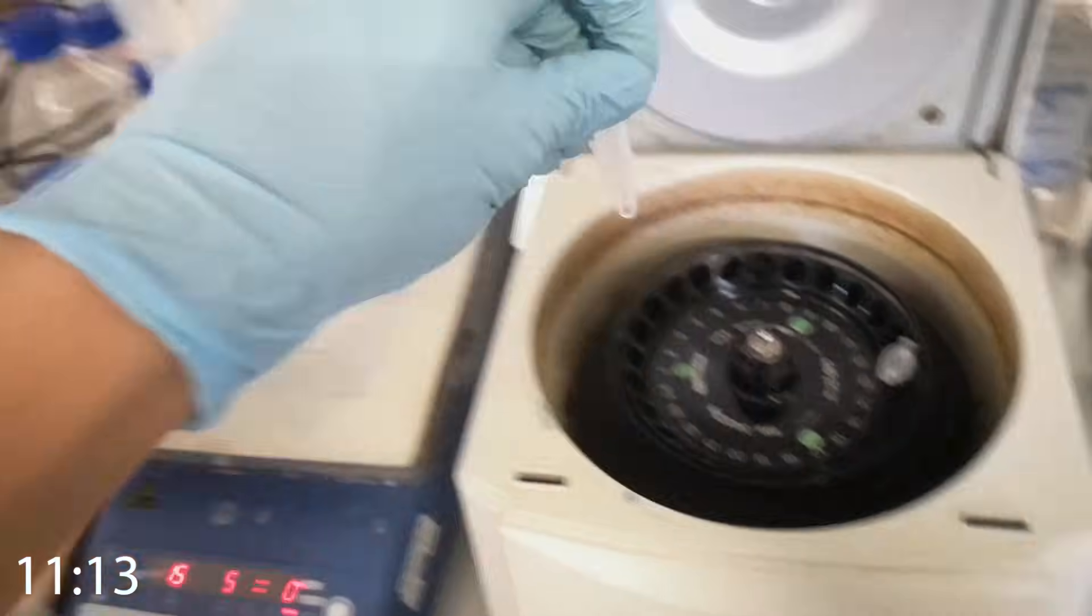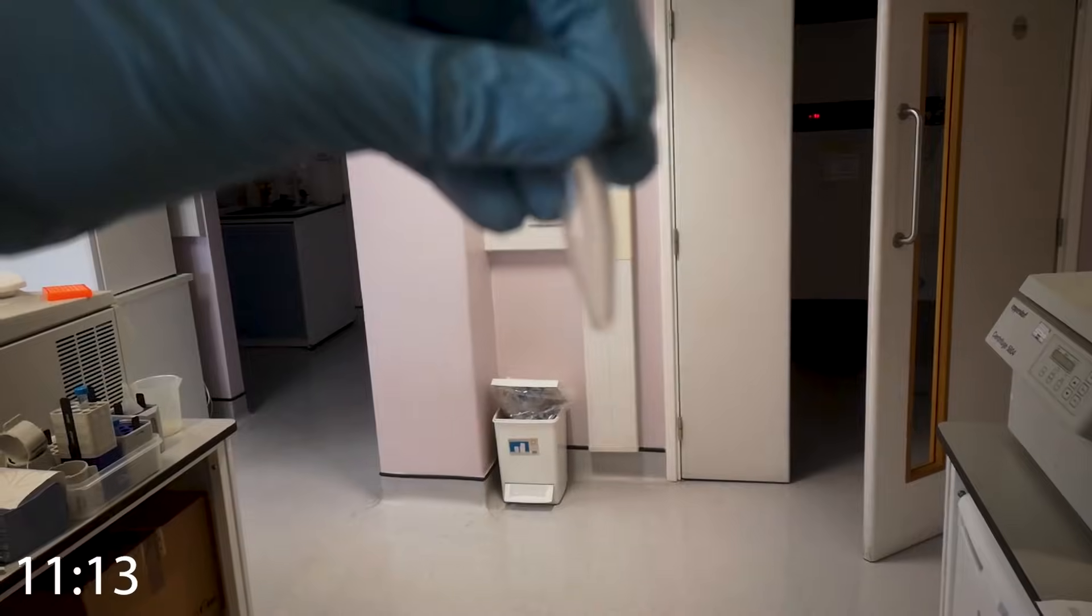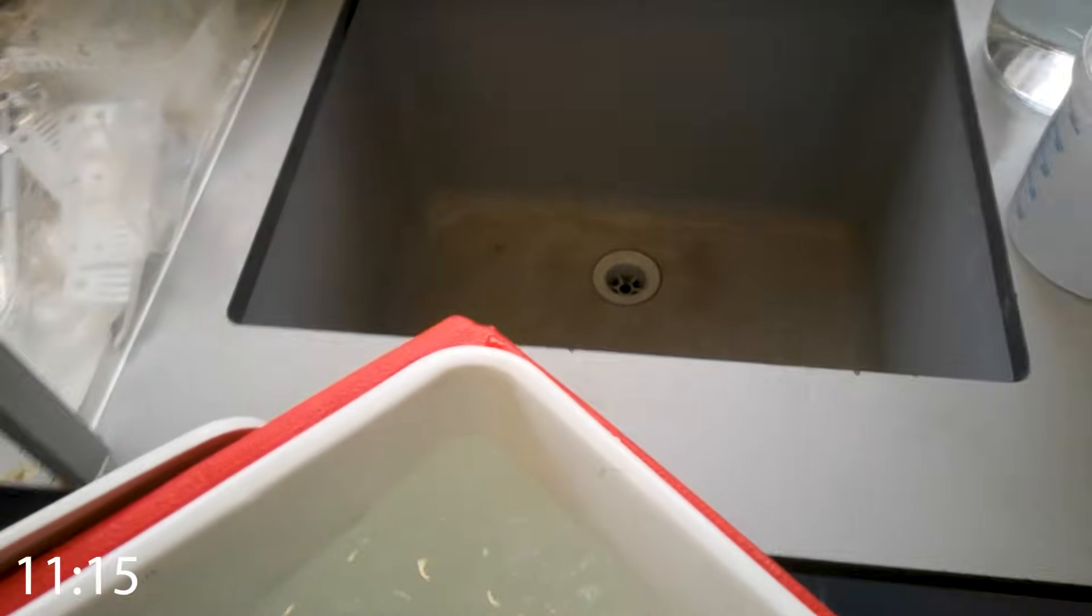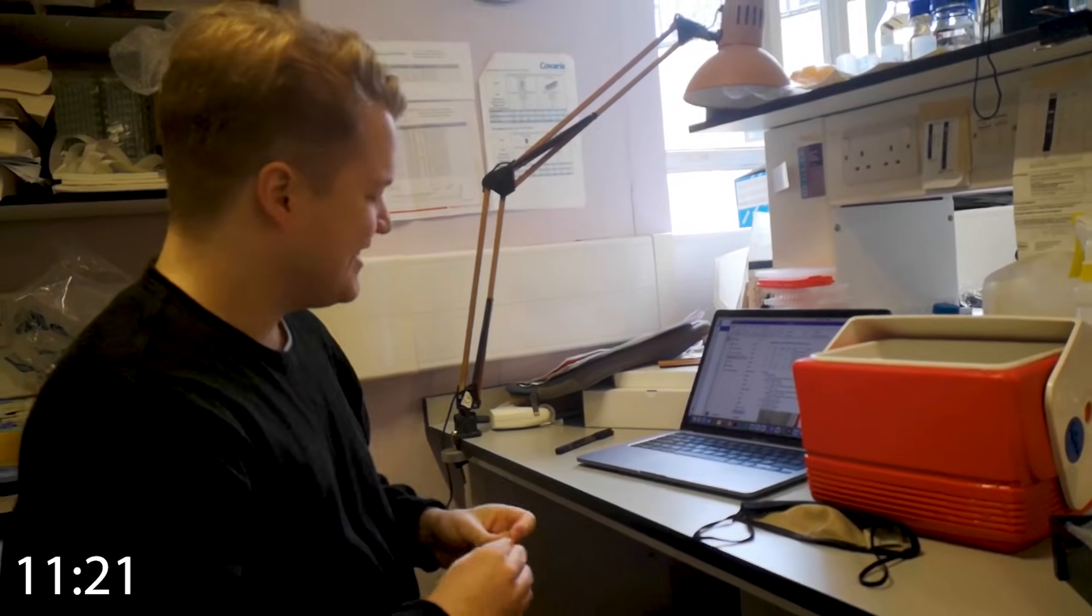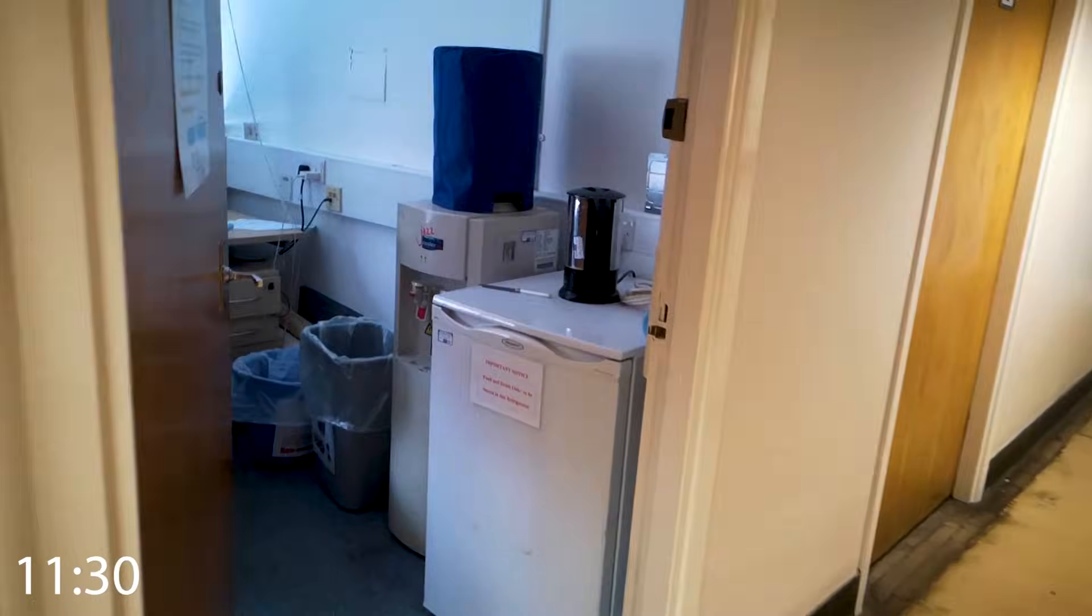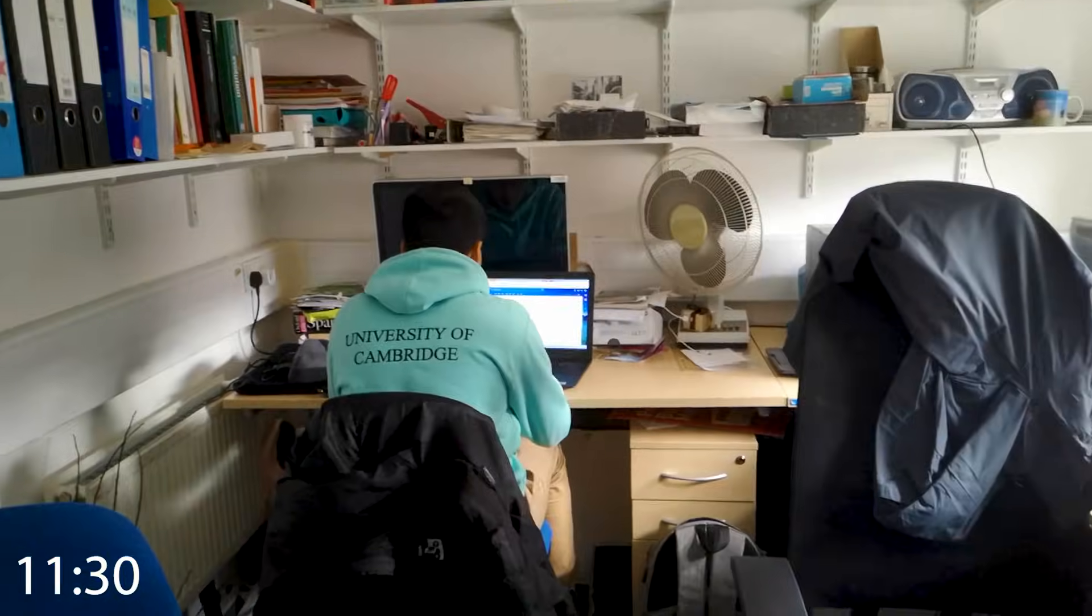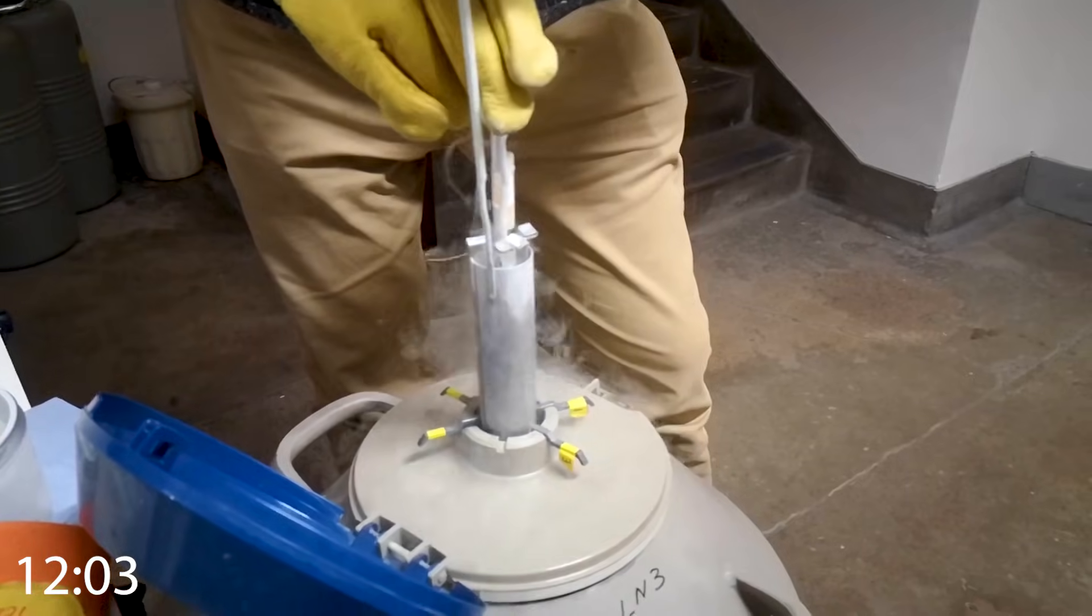Now when you open it, there's now loads more at the bottom. I then dump the ice into the sink to stop global warming or something. This is my lab partner Peter, he's currently like an hour behind, slacking as usual. And I head to the office where I see the undergraduate student who will definitely be my boss one day. And then our supervisor teaches how to freeze human cells using liquid nitrogen.